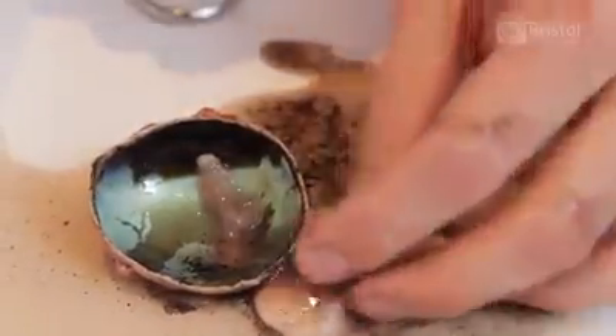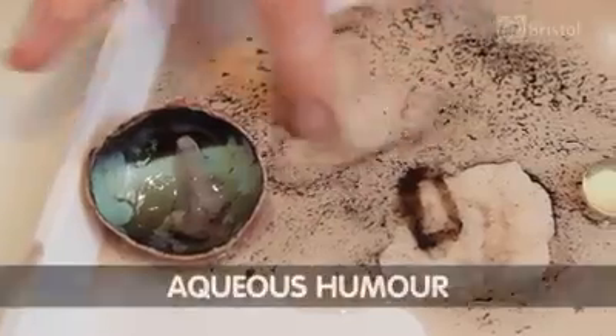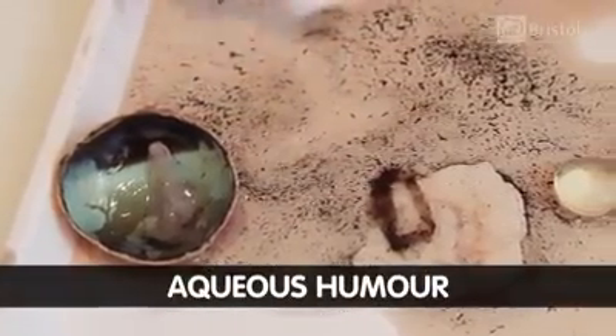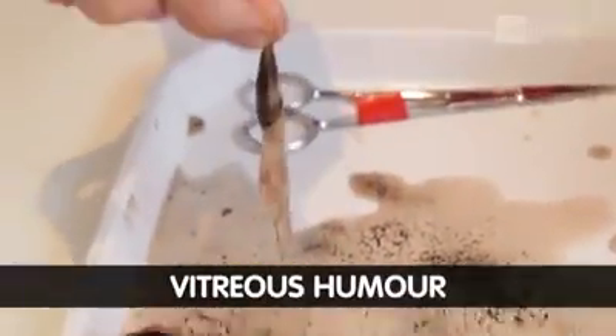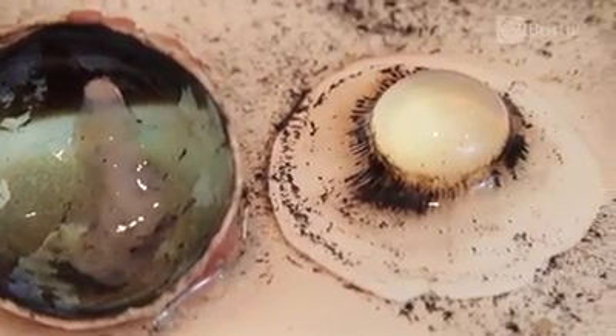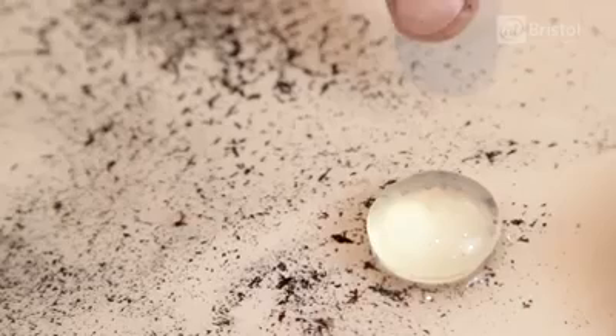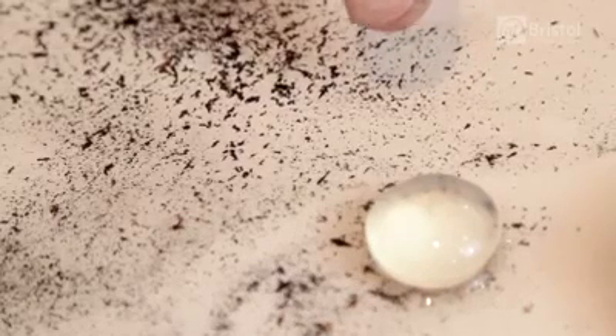Here we can see two liquids which have come out of the inside of the eye. This runnier liquid is called the aqueous humor, and this jelly-like substance is called the vitreous humor. These help to keep the round shape of the eye.